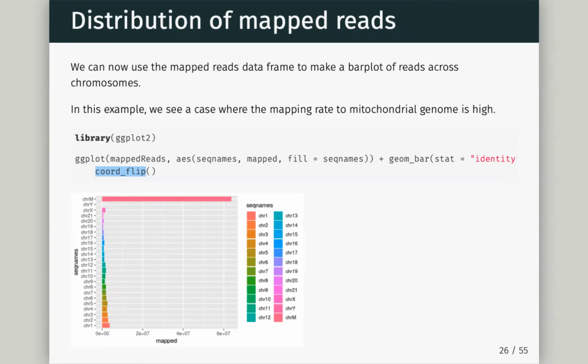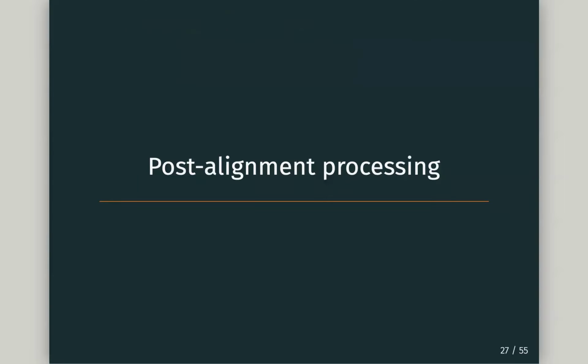So this is the first thing you can check to see if your ATAC-seq worked. It's the first thing people ask me to check for them. And then hopefully with the new methods, OmniATAC, etc., you shouldn't see this much of a problem. It's also a QC metric for single cell ATAC as well.